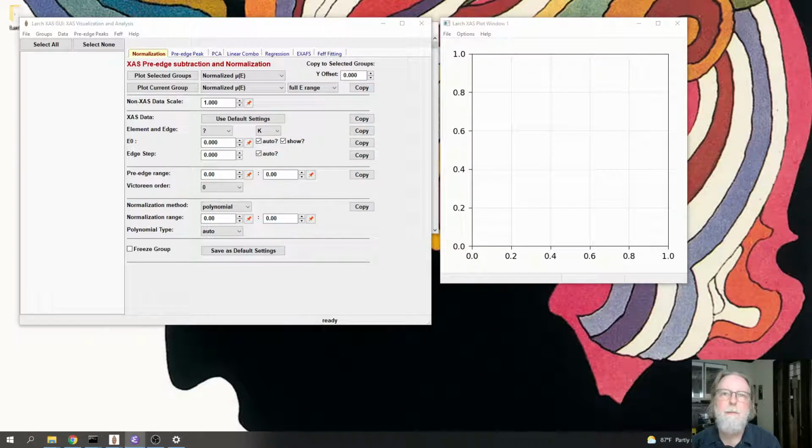So with this sum of paths formulation, you could say that each individual path contributes separately, or you could group paths together of nearly the same distance into a shell of atoms. Say all 6 near neighbors in a rock salt structure can be considered one path with 6 identical paths. The XAFS from each of these paths will then depend on the neighbor distance, the coordination number, and some measure of distribution in those distances for that shell.